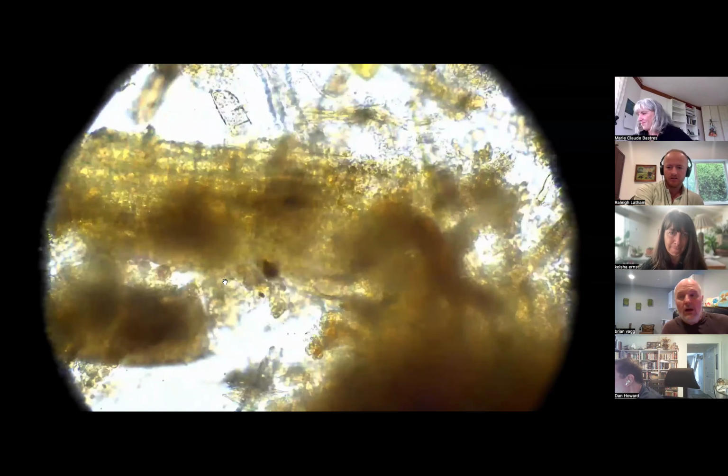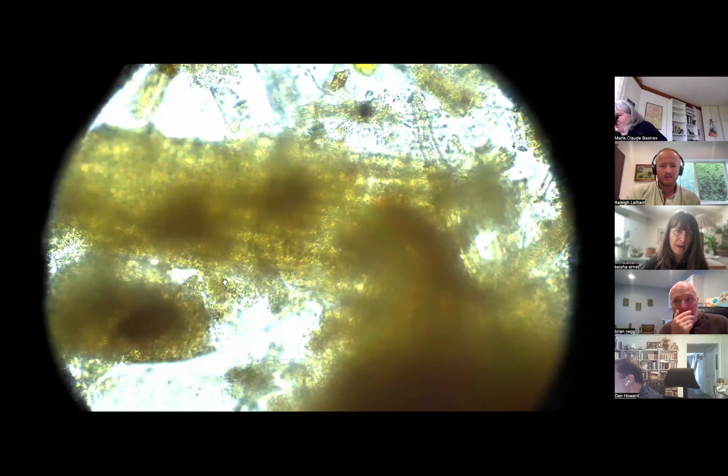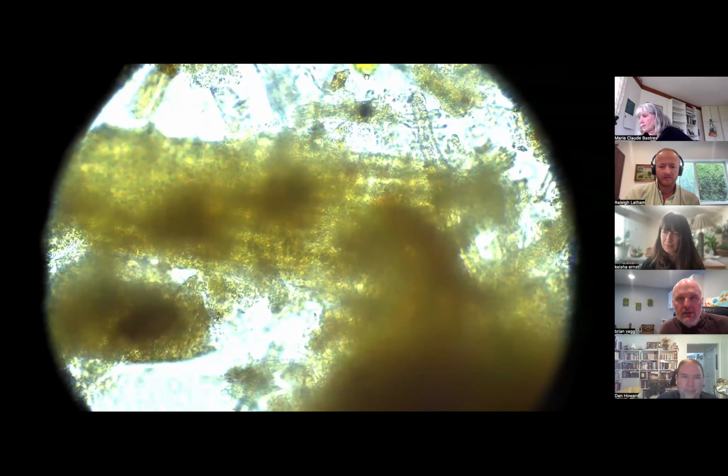Cool. Well, Brian, do you have another little sample you want to share, or should I stop now? No, I'll stop right now. Okay, let's take a look at samples from Marie and from Dan, and then we can come back and look at my vermicompost at some point, because there's some good life in there. Let me go ahead and stop sharing here real quick.